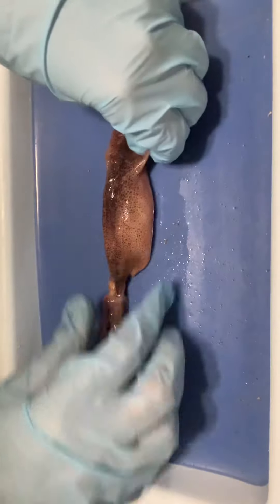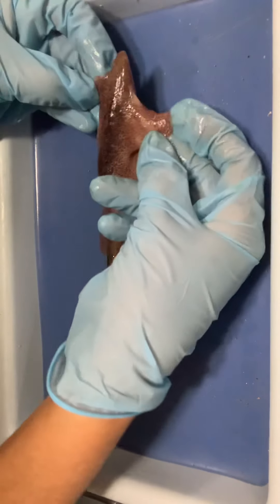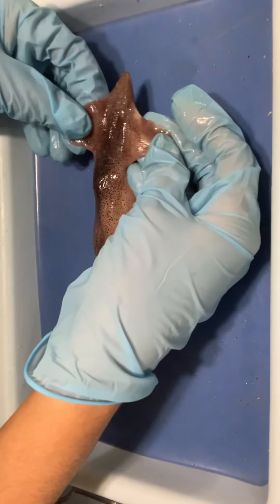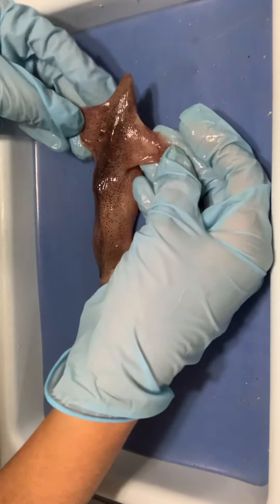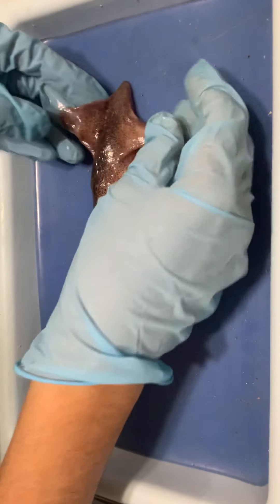Some of the key features we want to know are the fins, which are used in swimming and maneuvering. These guys use jet propulsion to get around, so they need some way of controlling themselves as they do that. So we have the fins here.